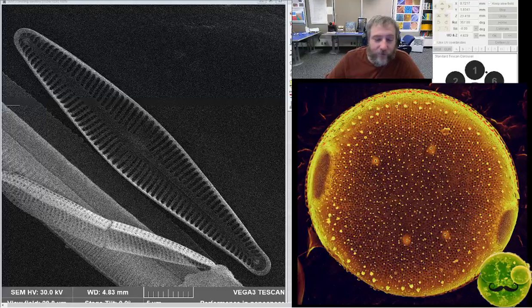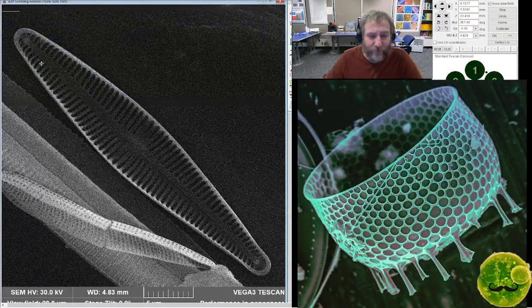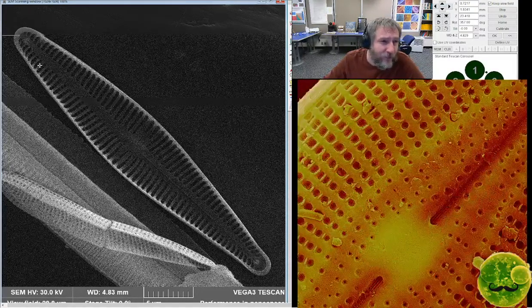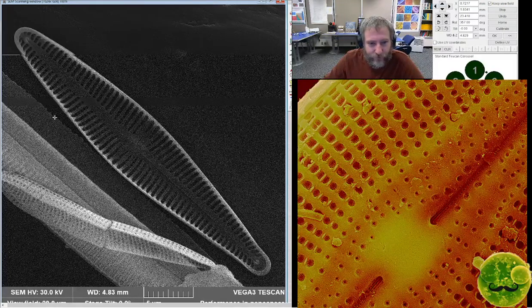There's some other things in here I still need to explore as well. I made some samples from like 4 different sites, and I was poking around in them a little earlier. There's a really rare diatom that Itzi's asked me about as well. And I don't know if I'll be able to find it or not, but we can give it a try. This looks like it's gonna turn out pretty good. Everything's in focus. So again, this is an internal view.